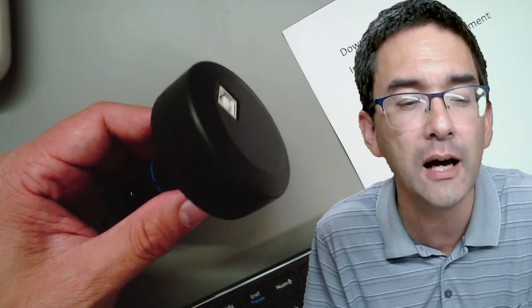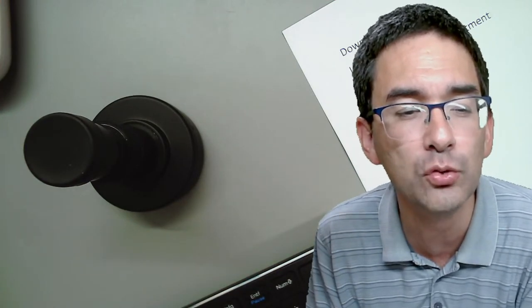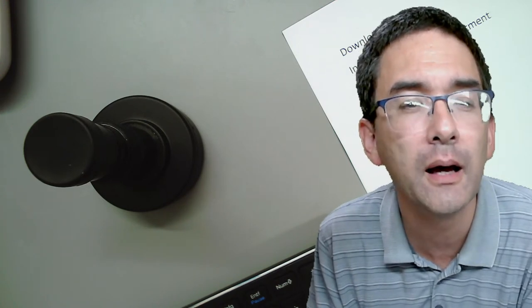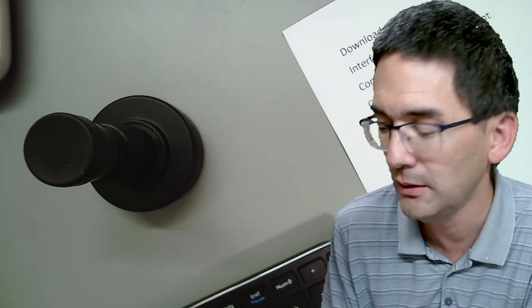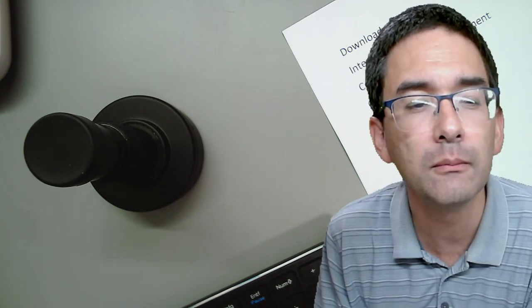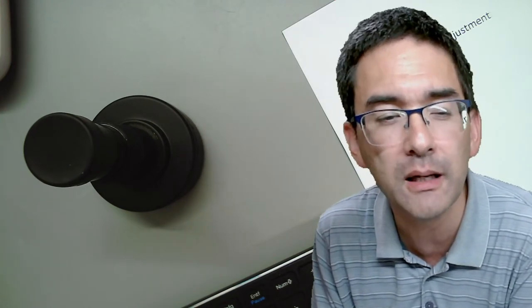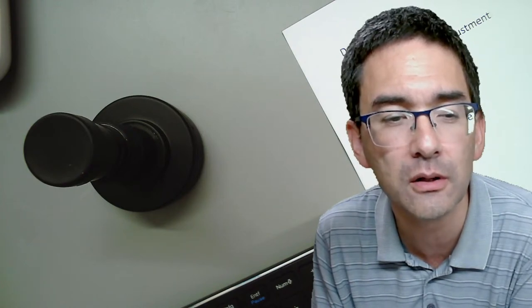What you have to do is you have to make sure that when you go manual exposure, you reduce the exposure time. Okay. I have to go over here, obviously. I have to, of course, choose the camera because I didn't do the camera yet. Okay, so here's the camera, and if you go down with the exposure time, then you see it's so short that it becomes black, and then you can go up with the gain.